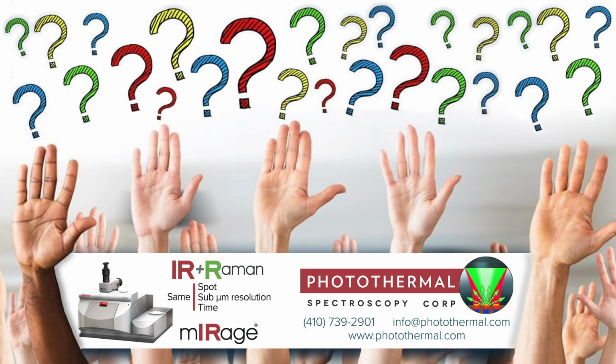Also, so-called two-dimensional models can be trained and developed using one dimension for the infrared spectra and a second dimension for the Raman spectra. And I think the combination of these two modalities, infrared and Raman, would give much more accurate classification models. We will also try to explore these possibilities in the near future.